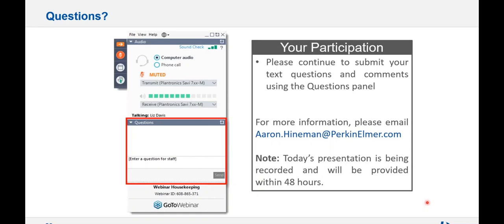What I will do is I'll take a plastic bottle that I know is cleaned, and you could always clean it with 10% nitric and then rinse it out very well with DI water, put it on the scale, tare it away, and then put the amount of modifier that you need there, and then dilute up to the weight. And don't make up too much modifier at a time, because every time you open up the bottle, you risk contamination. And of course, the cup you put it in has to be very clean as well. Yeah, so watch out for contamination of the cups. I find sometimes they'll get contaminated and then repeatedly going back in.